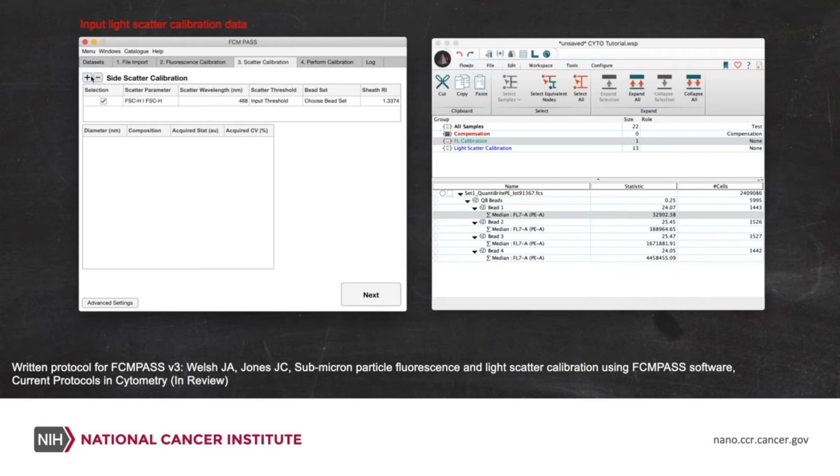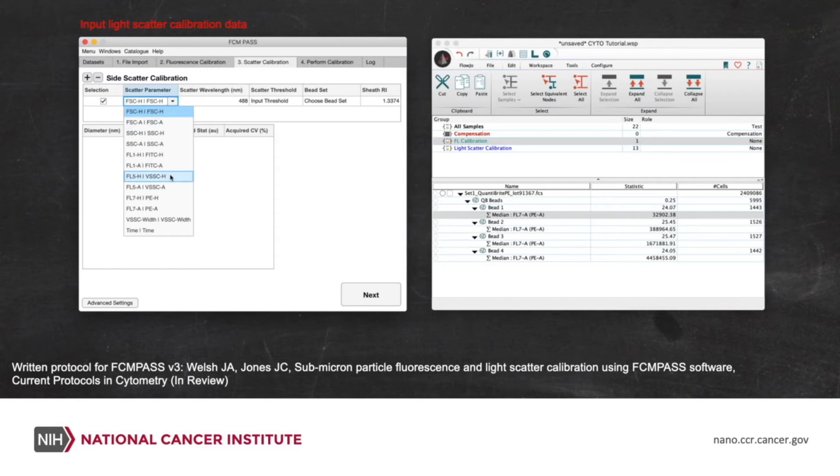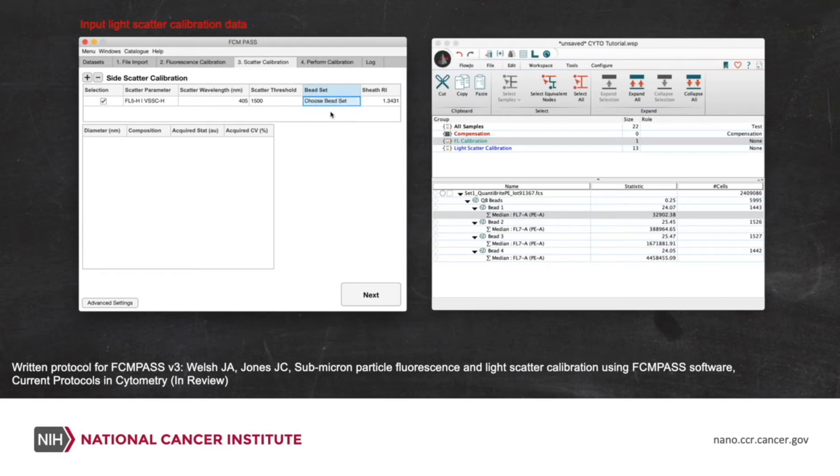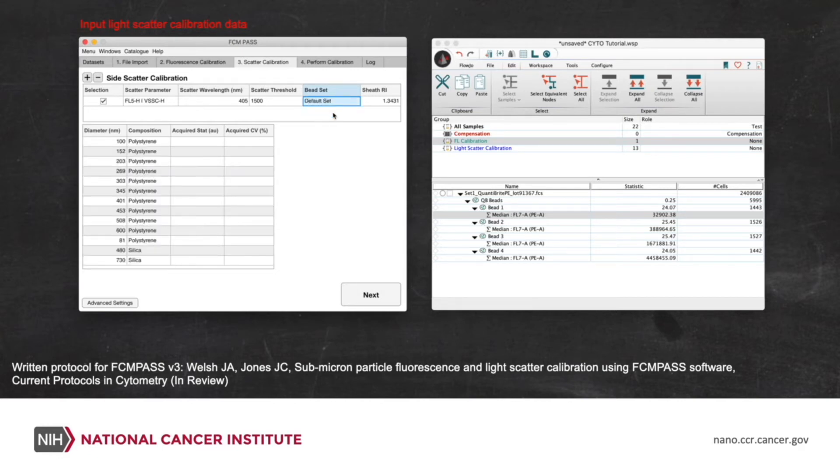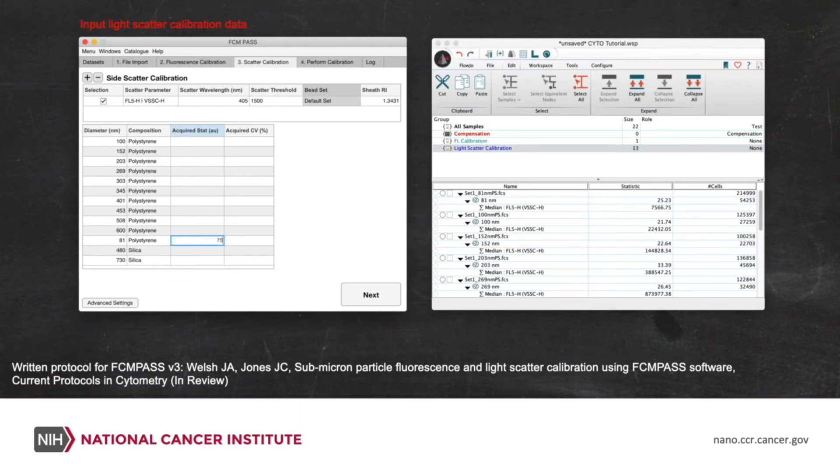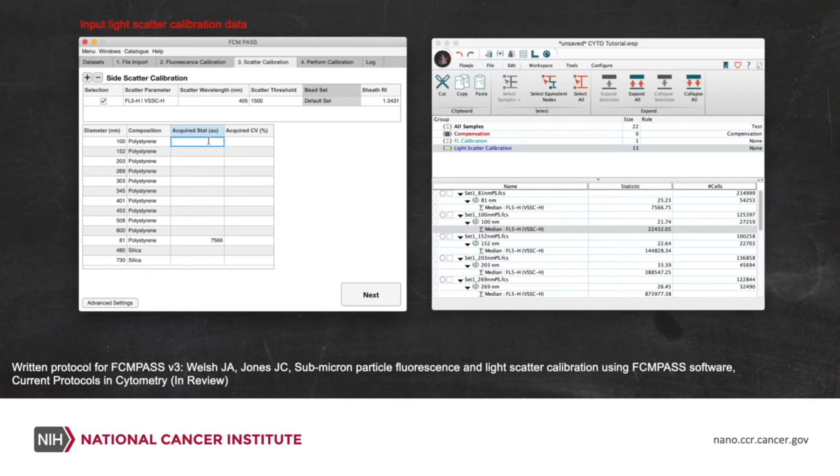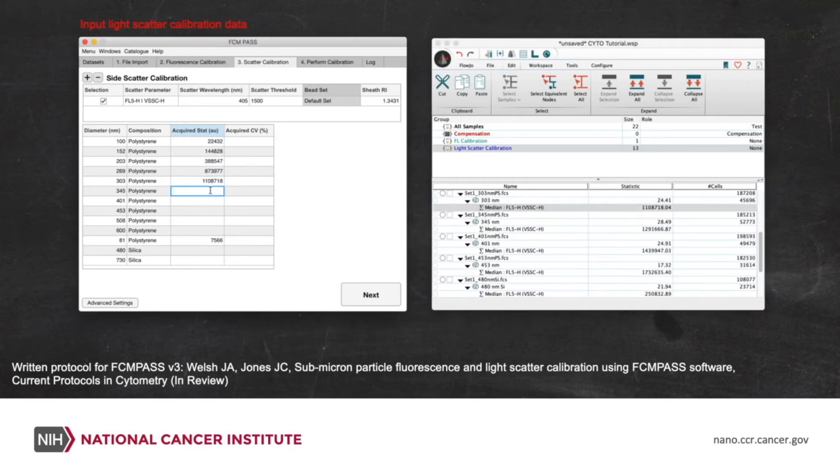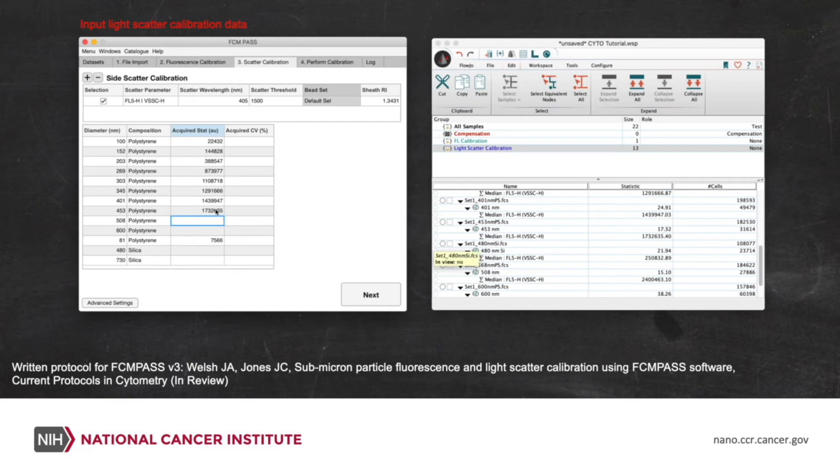Now that's all done, we'll go to the scatter calibration. We decide which channel we're calibrating, which is the violet side scatter height. You can see that the scatter threshold's automatically been detected. We'll change the wavelength and you'll see that the sheath refractive index is updated. And now we pick the bead set that we use for calibration. So this is in our catalog. It's predefined with all of the metadata. And again, we go back to our FlowJo data and we put in all of the median channel numbers for each of these bead populations.